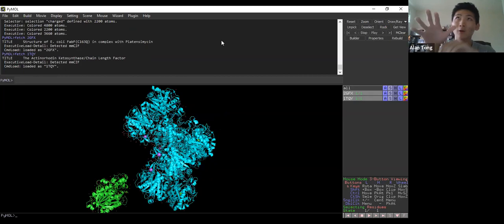Right? It'll tell you, well, if these two molecules are literally overlapping in space like that, well, we know that there are certain conserved regions. So it's not just the sequence that's conserved. We can see it in 3D. And so then we can start to understand how the structure plays into this conservation in evolutionary time.